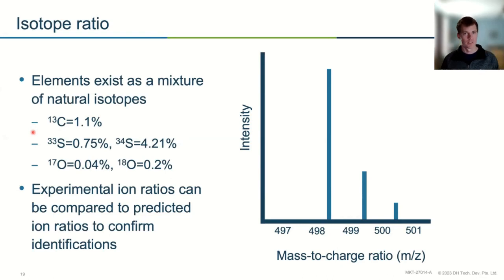And that's a little tricky in a mass spec, which is measuring things based on mass. It doesn't give 1 peak for carbon. It would give 2 or possibly 3, but probably 2, because I think C13 is the only real natural stable isotope. Instead of seeing carbon as that average molecular mass, you see each individual peak. We call the first peak usually the monoisotopic peak, and then we have additional isotopes. It gets even more complicated with a chemical formula, because if you have 15 carbons, you have quite a bit of carbon-13, so you see a bigger and bigger peak of that carbon-13.